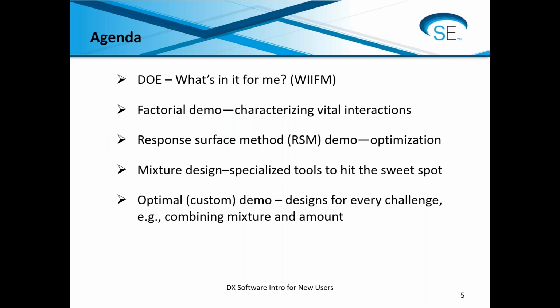Okay, let's see. So kind of the agenda, what we're going to do is we're going to briefly talk about design of experiments and, what's in it for me? Why would I do this? Okay, so once we get past that, then we're going to do three DOEs together.